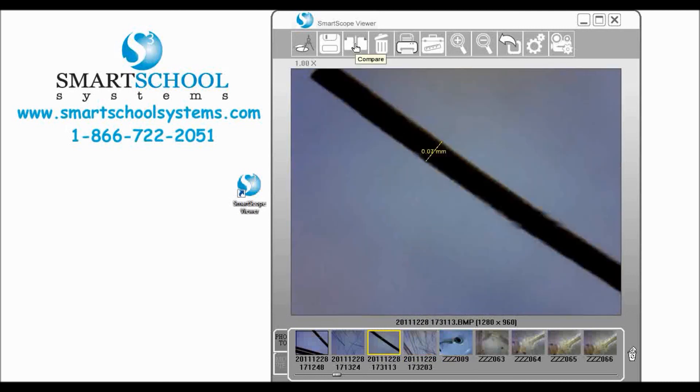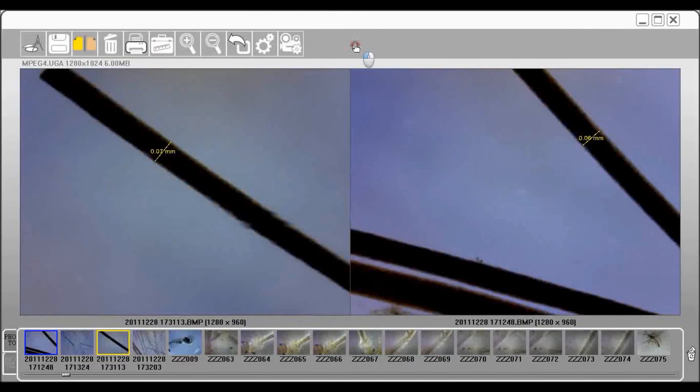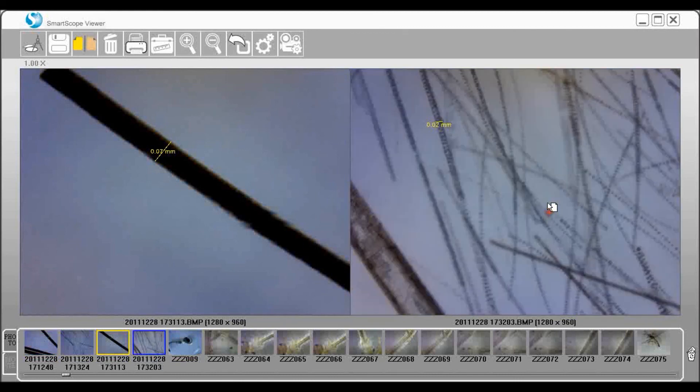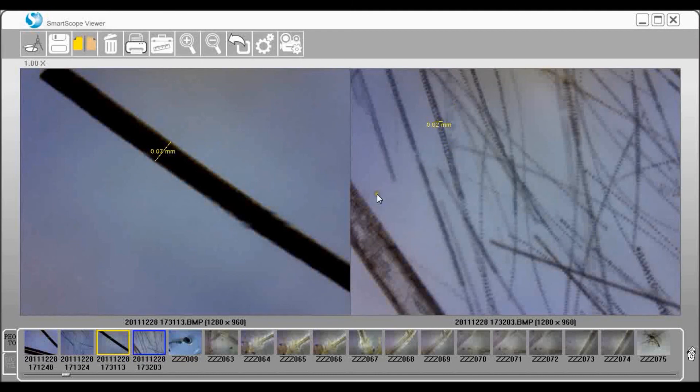We'll come up here to compare and we see our cow hair there on the left. I'm going to drag a rabbit hair image that we just took up there on the right so we can take a look at these and compare the difference in the width of these two.